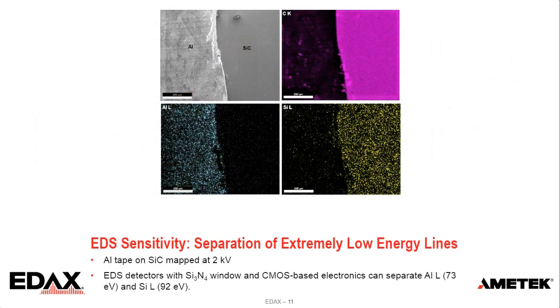This example shows EDS sensitivity in the extremely low energy range. This is aluminum tape on silicon carbide, mapped at 2 kV.